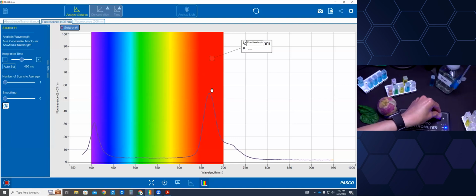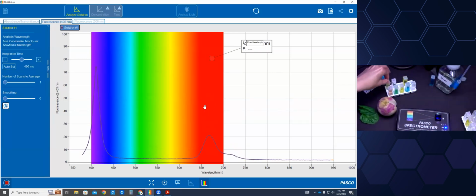So this is what plants do when you break their photosynthesis and they're stressed. They can't send those electrons, the light energy you give them, through their photosystem. So they just emit as red light. And you can actually see that from space. It's something that scientists can do. So that's what 405 nanometers looks like without.